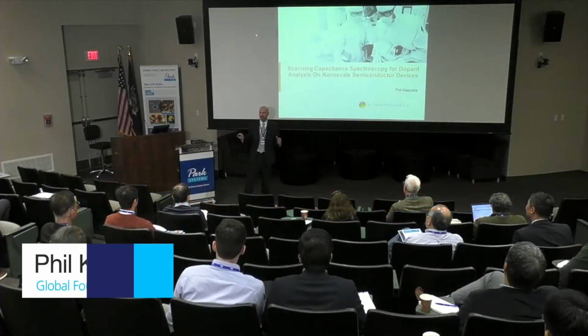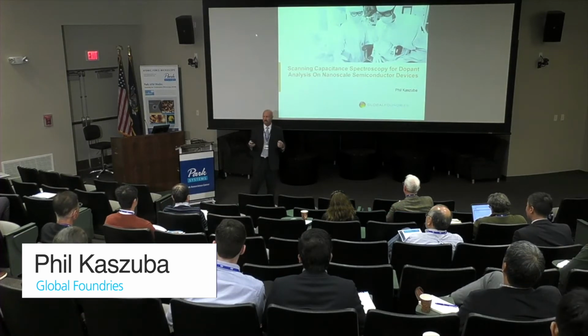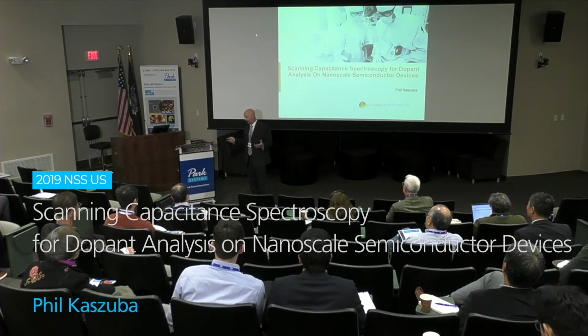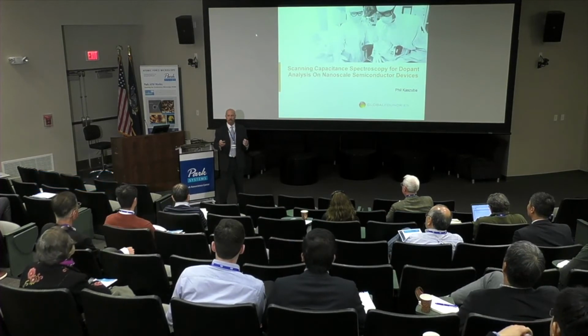The industry itself has been undergoing rapid evolution over the past few years. Because of this evolution, it's necessitated coming up with analytical techniques that are going to support the latest technologies, everywhere from technology development to finished products. We need to be able to understand the functionality, and as a consequence, we've had to develop new techniques for analysis, and scanning probe microscopy has lent itself very well to giving us an understanding of these new devices.